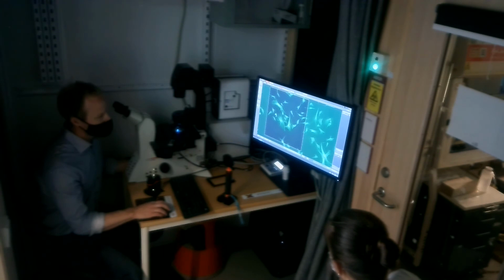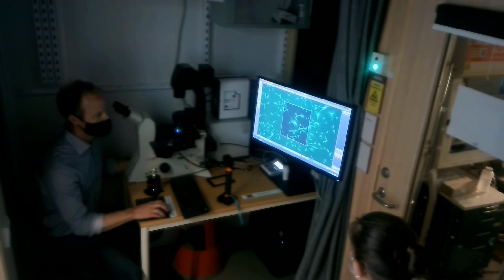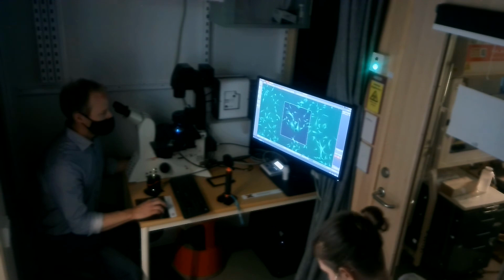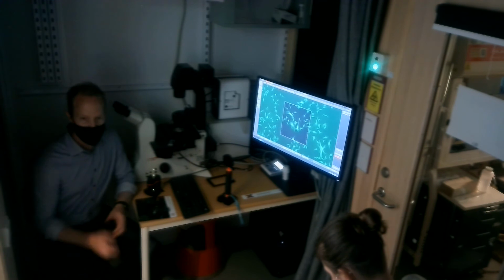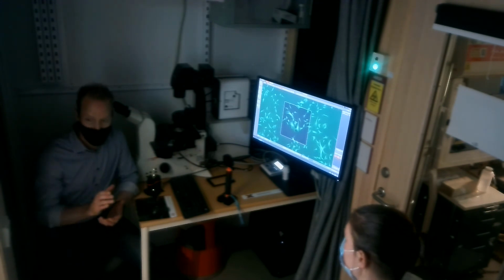And if this is something I want to capture, I can go with another mark. Now I have these two marked, and I can move between them. I can click on this, it will move to this position, and click on the other one, it will move to that position. One thing here, so this is the mark. So this is for me one of the better ways if you're going to do multi-position. So a single frame, but several of them, yeah?